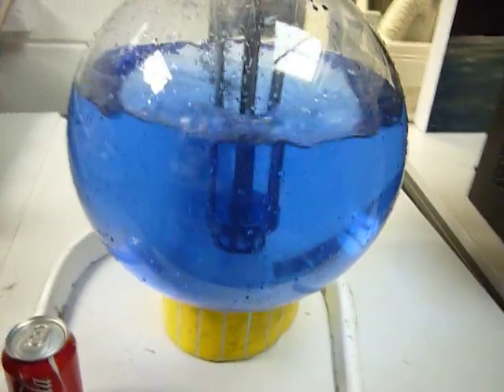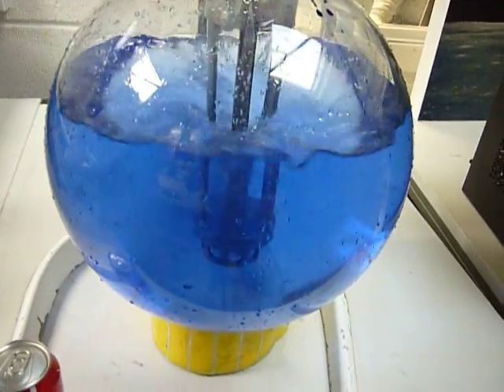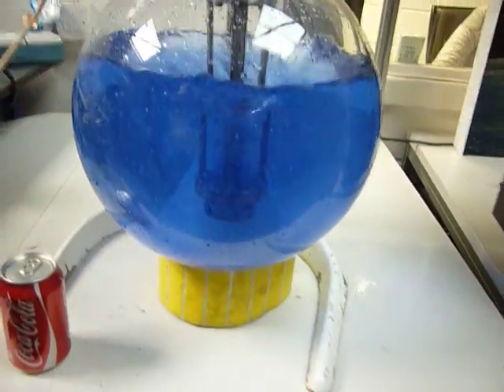This is high speed now. You can see now it's really starting to race on and you can see the mixing action close to there with the homogenising head at the bottom.